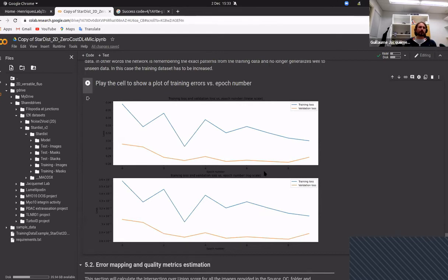The first one is that we've been training only for 10 epochs, so there's not much time for gathering data on how the model is evolving over time. The other reason is that we've been using transfer learning. So we are already starting from a model state where the segmentation works already quite well. So there's not so much learning to do for the model. It only needs to learn a little bit from your data and to optimize using your data to improve. So that's why you also don't have a huge difference in the loss over time.